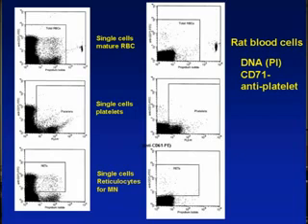But on the other hand, you don't have much of the CD71, which is a reticulocyte marker, and you see a few spots here. This could be just the contamination of your sample, or could be the electronic contamination from your instrument. Nonetheless, this will be your sort of background count. Usually it's very, very low, less than 0.01% of the total event. But you do have the marker here for the platelet, so that will allow you to put the platelet into a proper position so they don't influence your measurement of the reticulocyte.